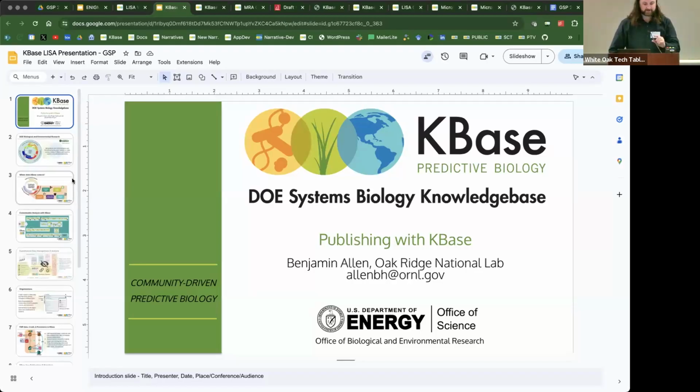All right, so thanks, Lauren, for that presentation about some of the new long read assembly tools in the workshop. Just quickly, before we end our workshop today, what I wanted to share with you all is some of our vision for KBase as far as publishing and sharing data that users are generating. Like Lauren showed, we have a lot of tools for processing reads, assembling genomes, annotating them, and so on.